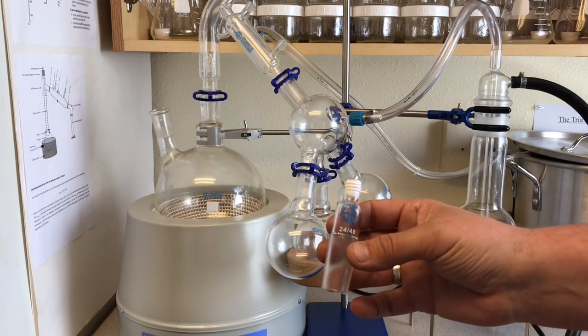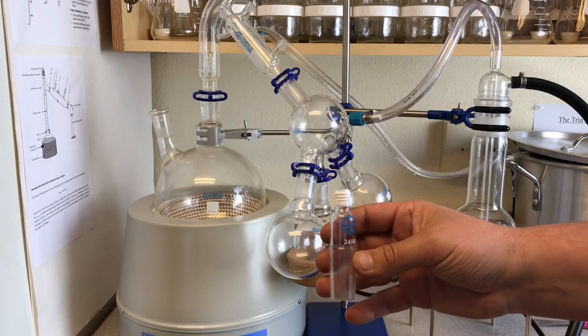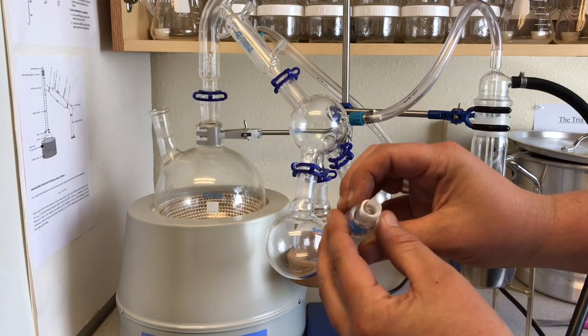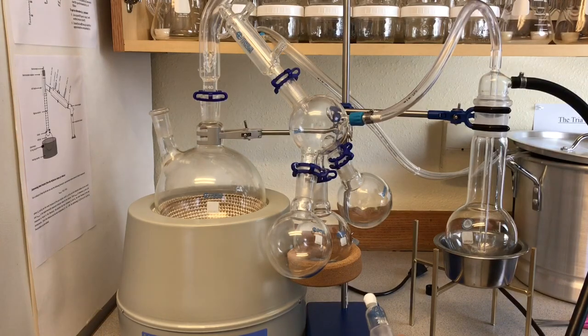And here's my thermometer adapter. You can see that I've wrapped the top of that with the Teflon tape, making sure to keep the Teflon tape out of the hole there. We're going to be using this with our thermometer probe.